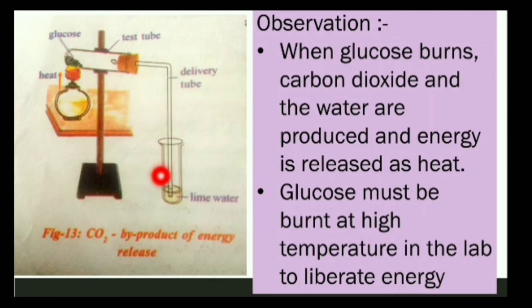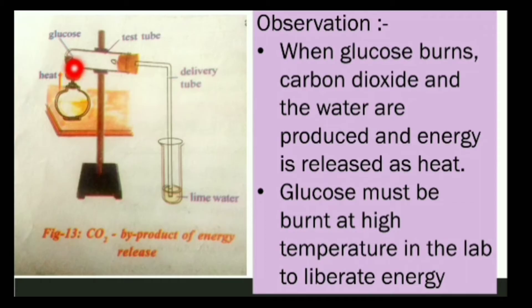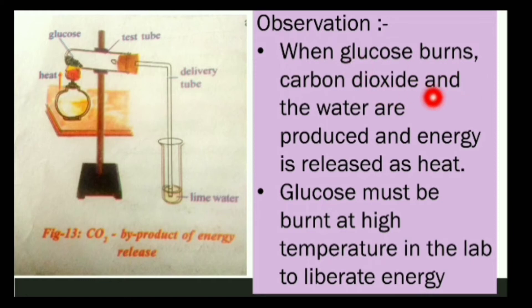Heat the test tube until the glucose catches fire. When glucose burns, carbon dioxide and water are produced, and energy is released as heat.